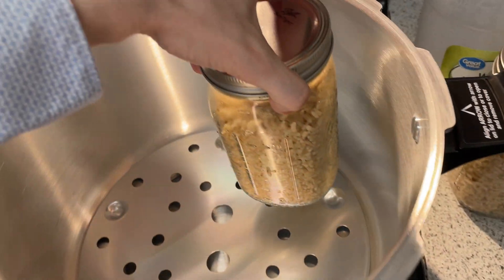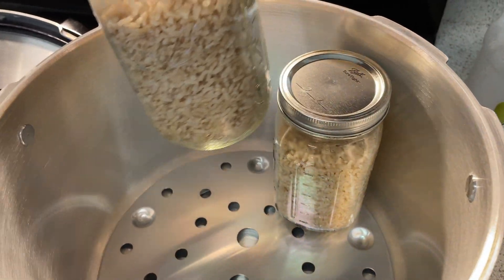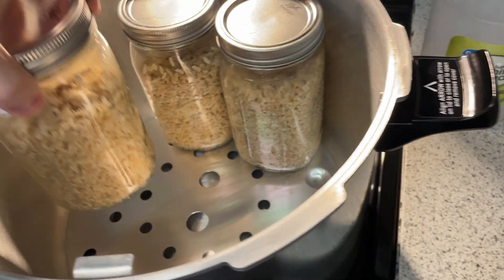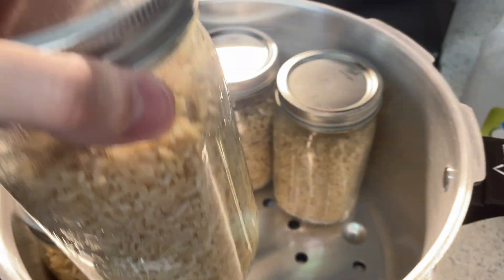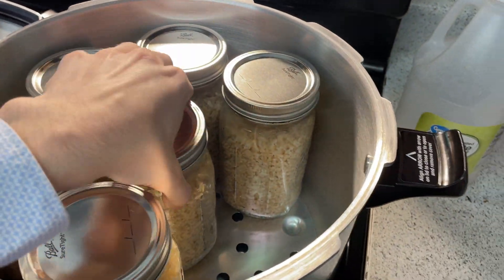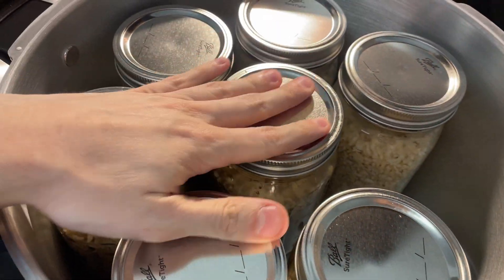Now that it's time, load them all up into the pressure cooker. When you have seven jars, you're going to make a ring of six with the seventh in the middle. I'm using a 16-quart Presto, so if you are too, this is what it'll look like. Just showing you what it looks like with the seventh one in there.